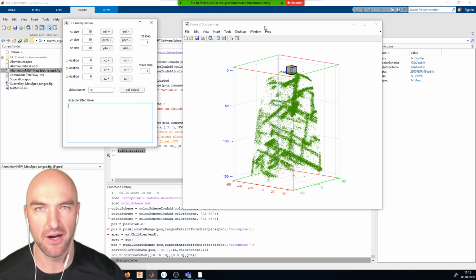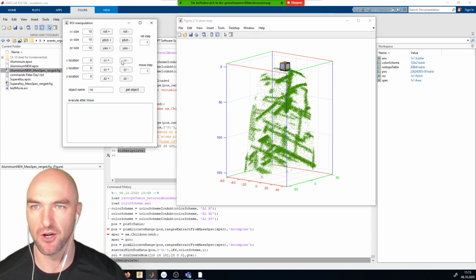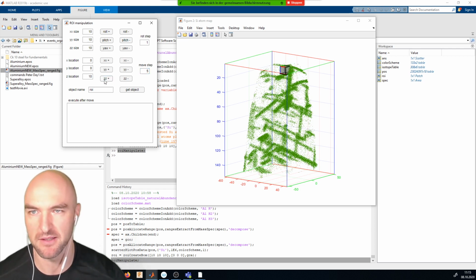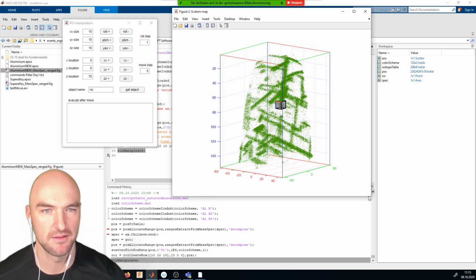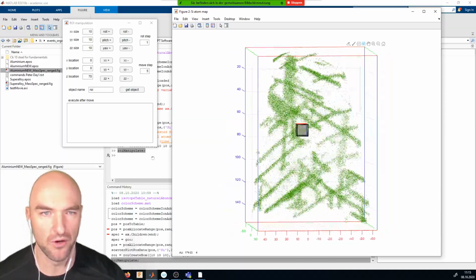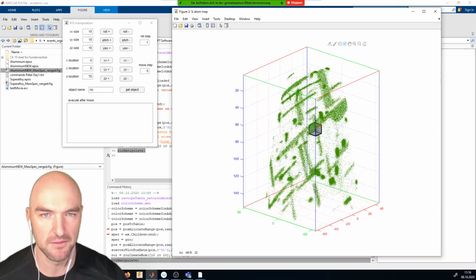Okay, but for now, let's start and move the cube. So, it's pretty obvious that first we might want to go to positive C. Obviously 5 nanometers is maybe a bit of a better step size. And so we can start moving our cube around. And we might want to pick one of those precipitates. Maybe, I like this one.